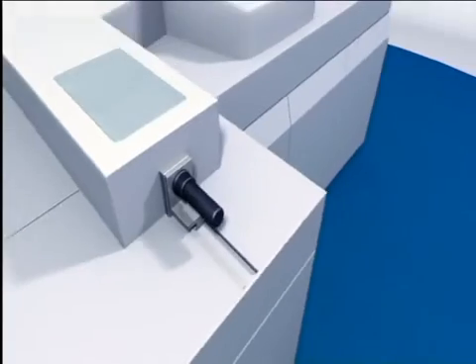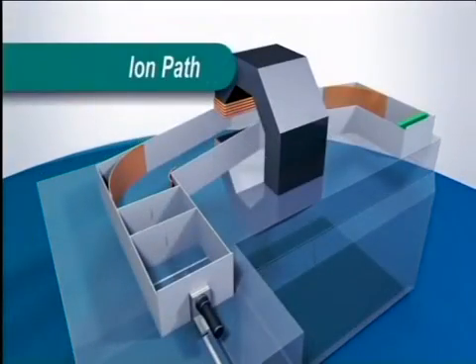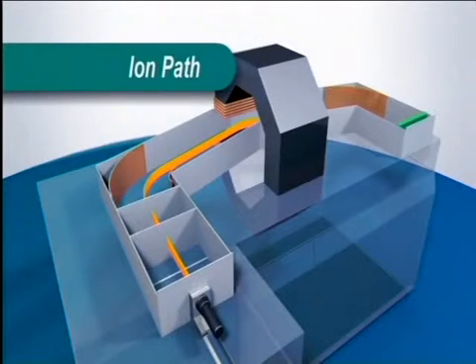The positive ion beam passes between two charged curved plates, which deflect it in a curve so that it enters the area here, where an electromagnet produces a vertical magnetic field. This further deflects the beam in an arc of a circle. On emerging from the magnetic field, the beam is deflected again by another set of charged plates which direct it into the detector.